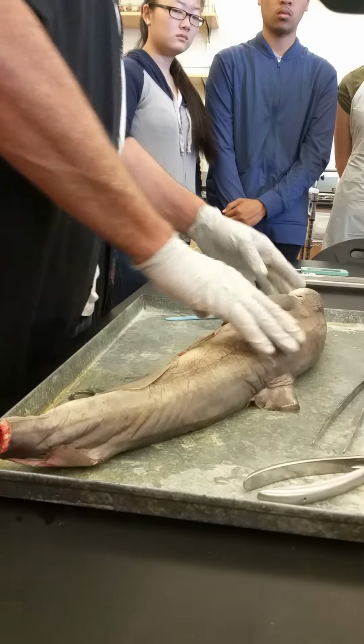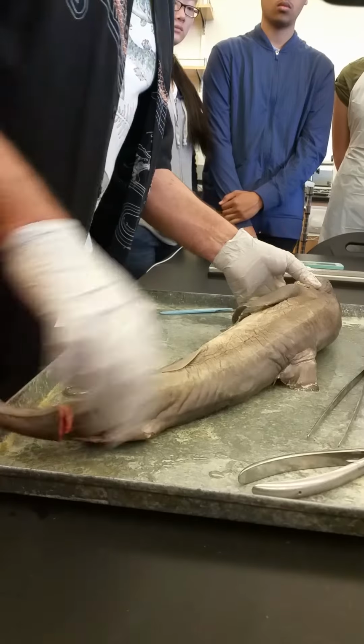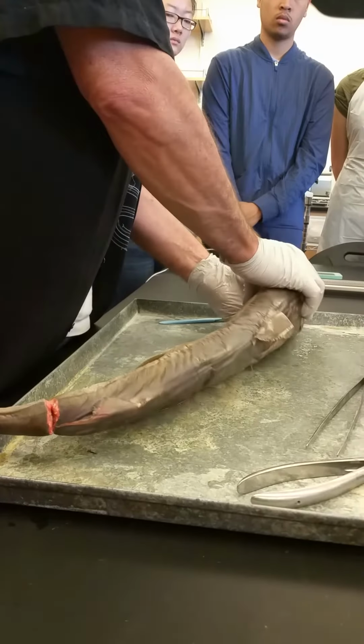And again, the sensory systems are amazing. We'll talk a little bit more about that. Speaking of sensory systems, again, pretty big eyes.